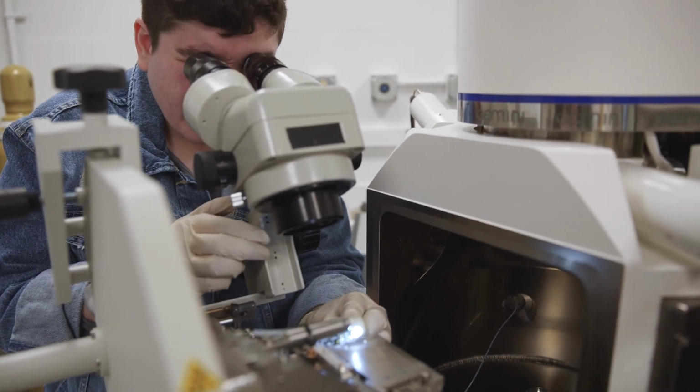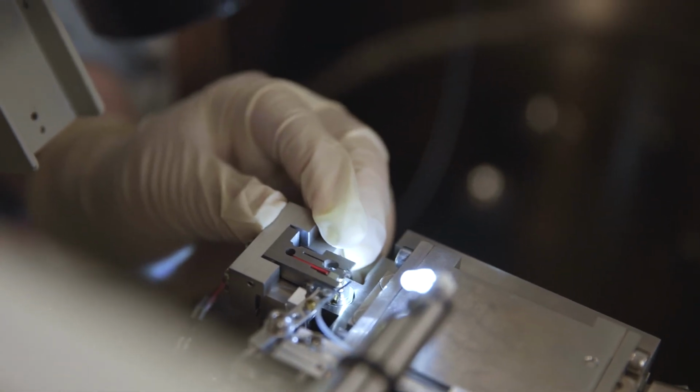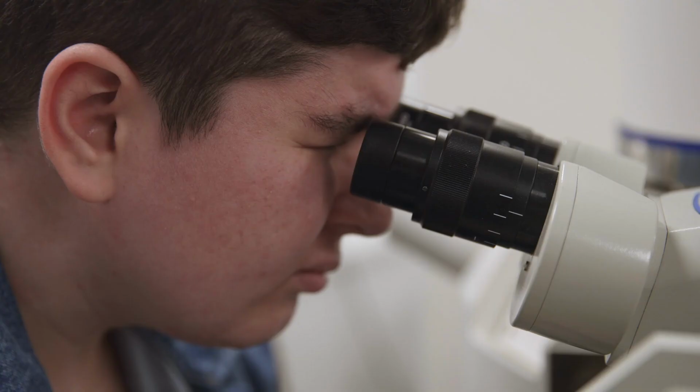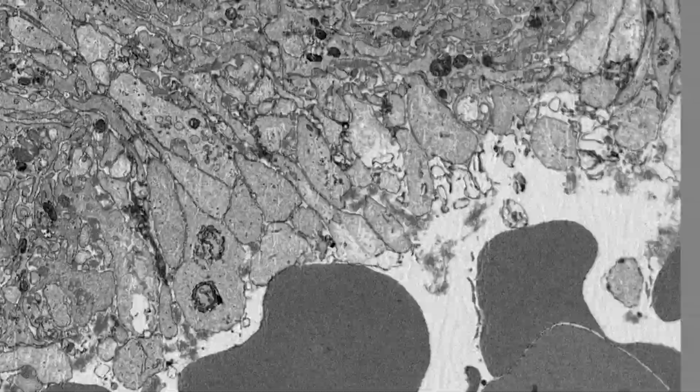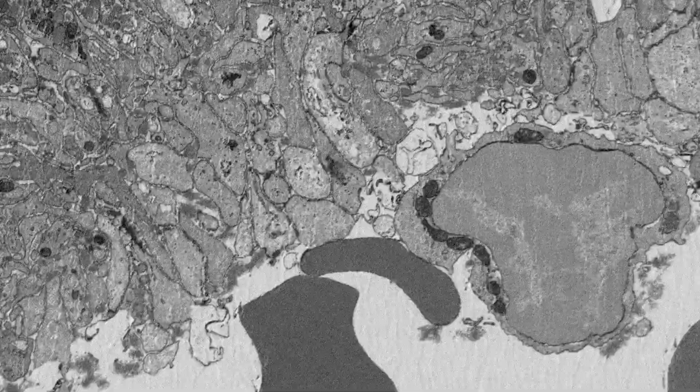There are 2 projects our lab is working on that I'm a part of. The first is a project with COVID blood samples, and the other project that we're working on is on occlusive blood clots and examining the structure of the blood clot as to where red blood cells are within it, how tightly packed the platelets are, and so on.